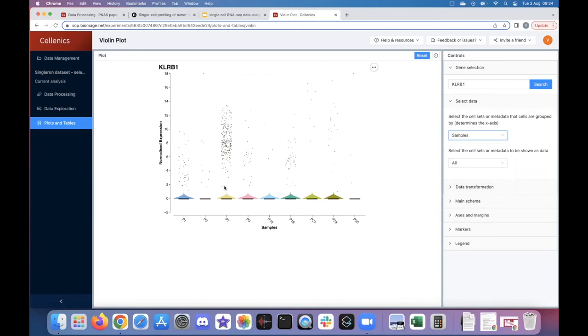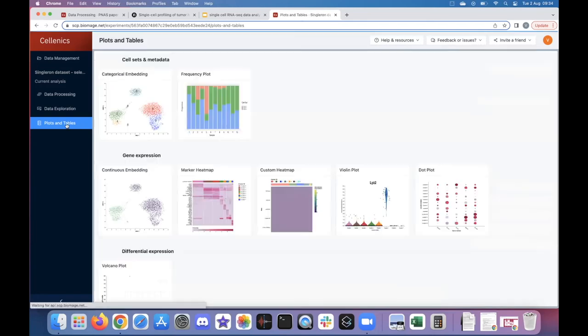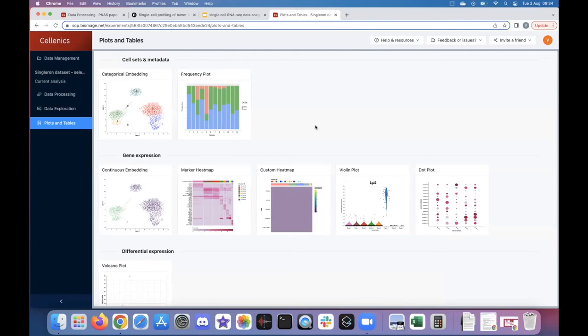Looking at KLRB1 expression across samples, we again see that P7 — which had a large proportion of T-cells — also has very high expression of KLRB1. In summary, I've guided you through the three main modules of Cellenics. There are many other features I haven't shown today, such as pathway analysis and many other plot options. I'd encourage you to join one of our workshops or check it out yourself to explore the full range of features available in Cellenics.